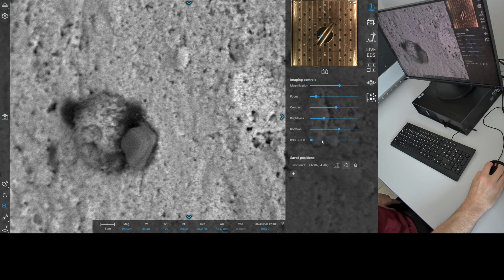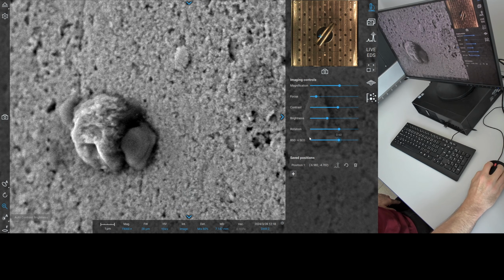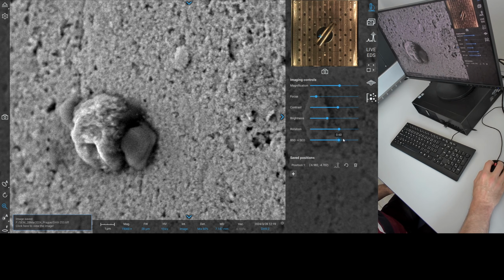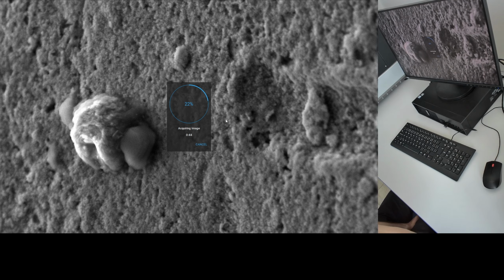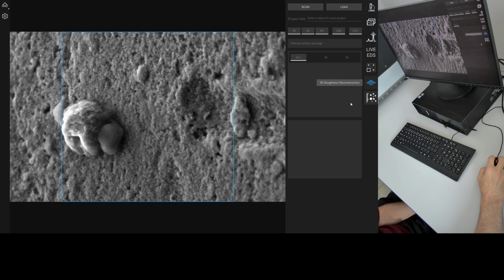I will change that to a mix. We'll do a different adjustment here. We'll do one shot like that. Take a 3D shot of this area as well. Yeah, okay. Try a full-on SED here. Object scan of this. Okay, so we're going to go and do this geometry area here.